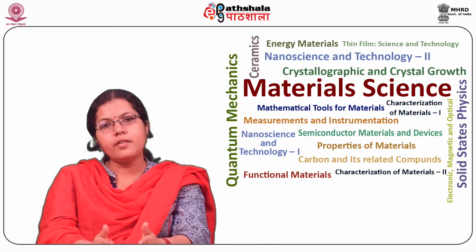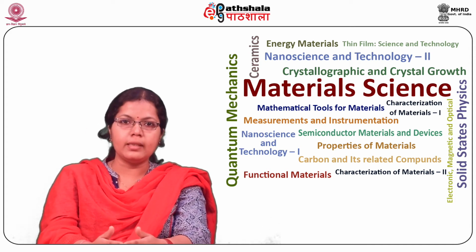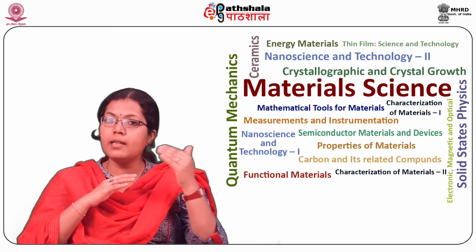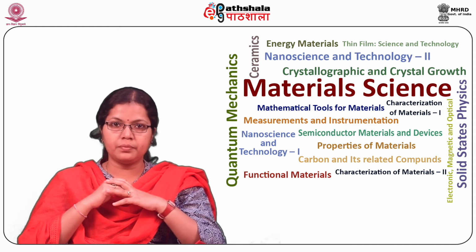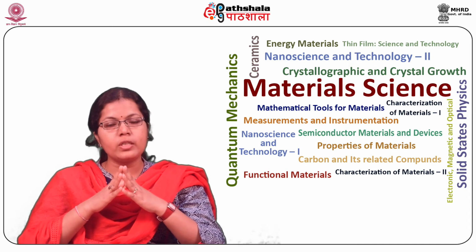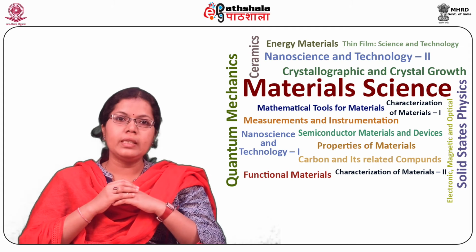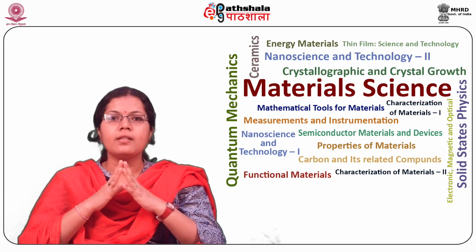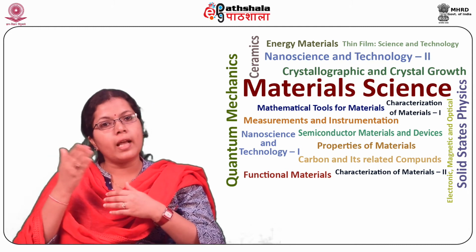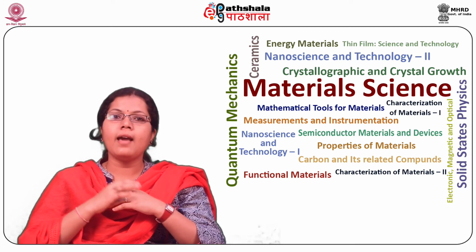Secondary electrons are the loosely bound electrons near the surface of the sample, ejected by the incident high energy electrons. They have energy in the range 10 electron volt to 50 electron volt. Secondary electron yield increases with increasing tilt of the sample with respect to the electron beam direction and increases with decreasing energy.